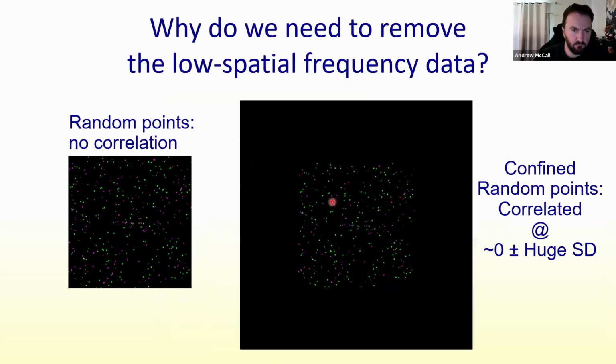Once you have all that, you will have your results. Sorry, messing up here. One of the most important pre-processing steps here is the mask. So I want to quickly discuss this using this rather simple example.